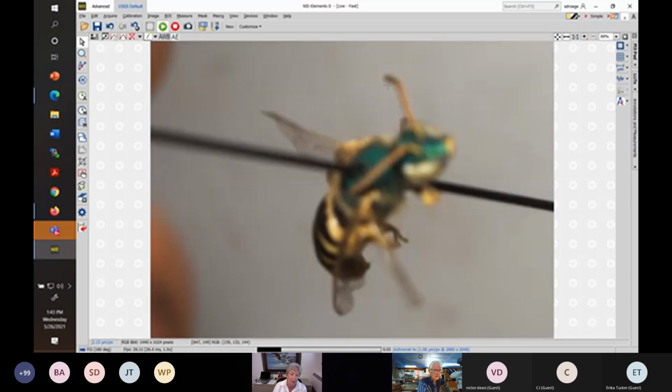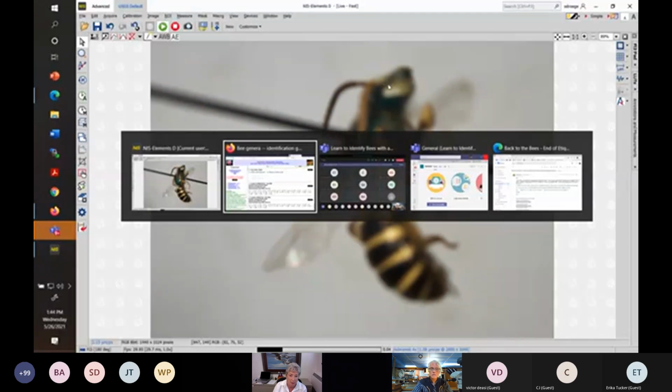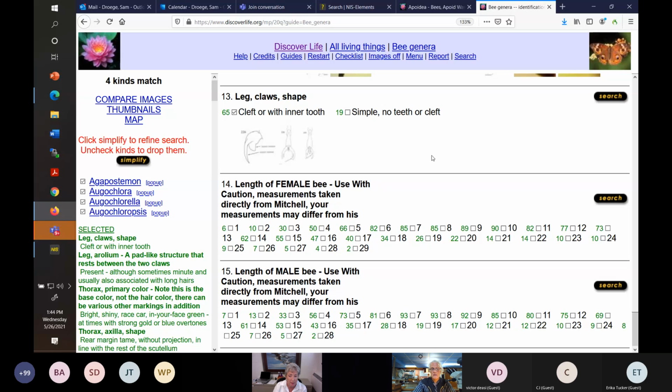So that's a little treatise on how we do the measurements. And again, because we want you to get the right answer versus being pristine in our measurements for, say, a taxonomic revision, we're going to what we call overscore things like this, where there's a range. So we'll bump it out a millimeter, sometimes 2 millimeters, so that you're relatively safe in your measurement and in scoring for this. So again, useful at big and little, not so useful in the middle for the genus guide.